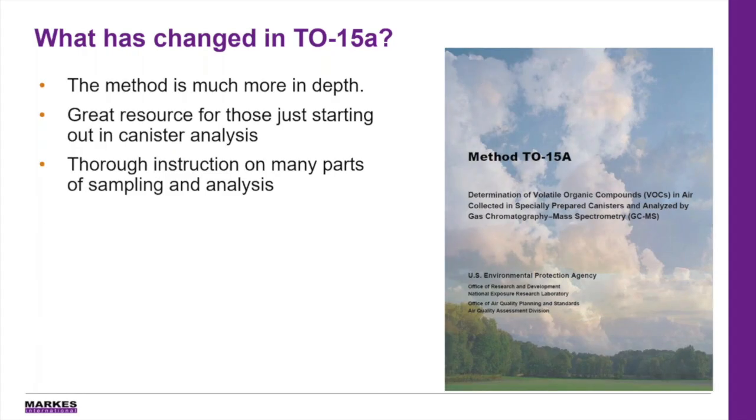Now, on the face of it, the first thing that a lot of people will notice is the method is much more in depth. It's a great resource for anyone just starting out in canister analysis, and this was part of what the EPA were trying to do when they wrote it. It's very thorough in its instructions on parts of sampling and analysis, and they also wanted to give users and people carrying out the method the confidence to troubleshoot this analysis as well.